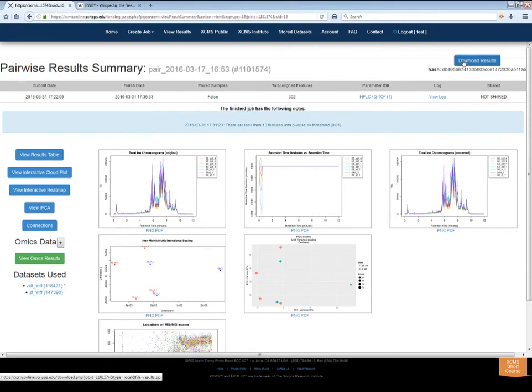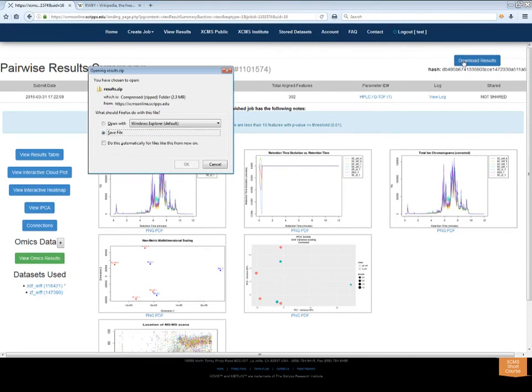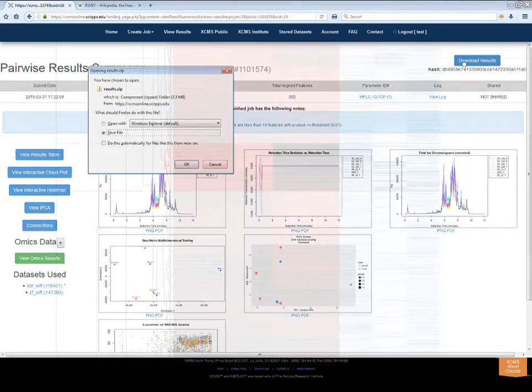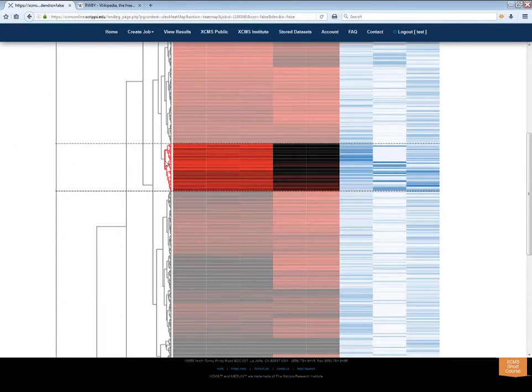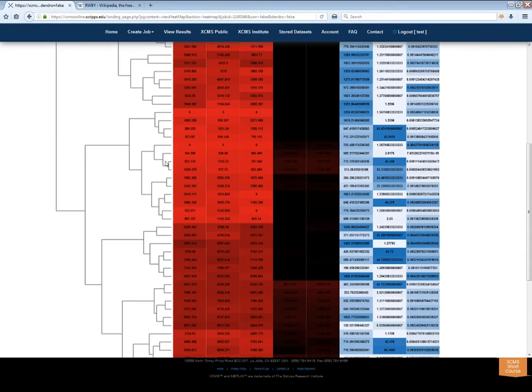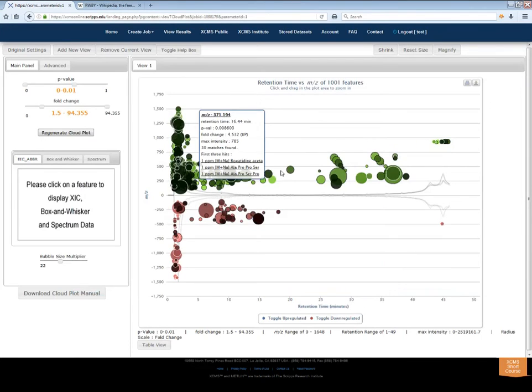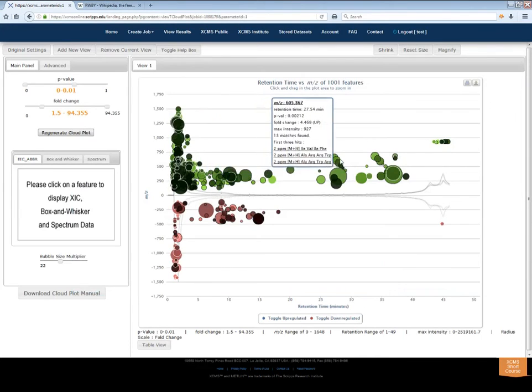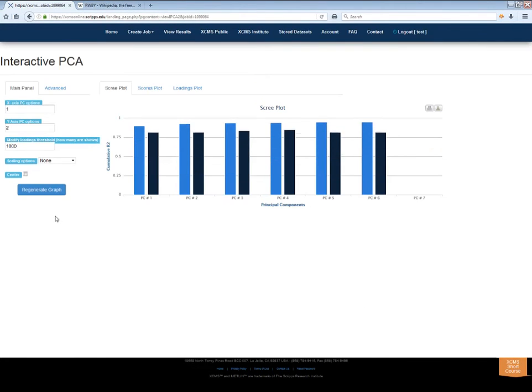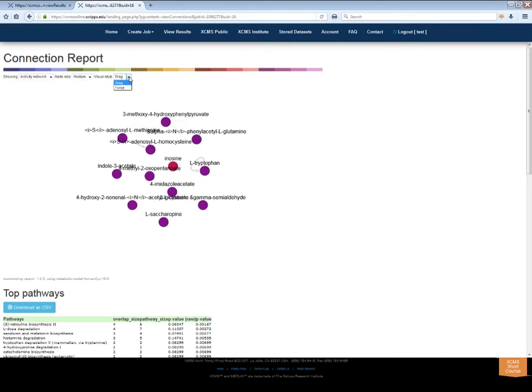You can even download the entire set of results. Some of the available tools include an interactive heatmap with dendrograms, a cloud plot, principle component analysis, and connection reports.